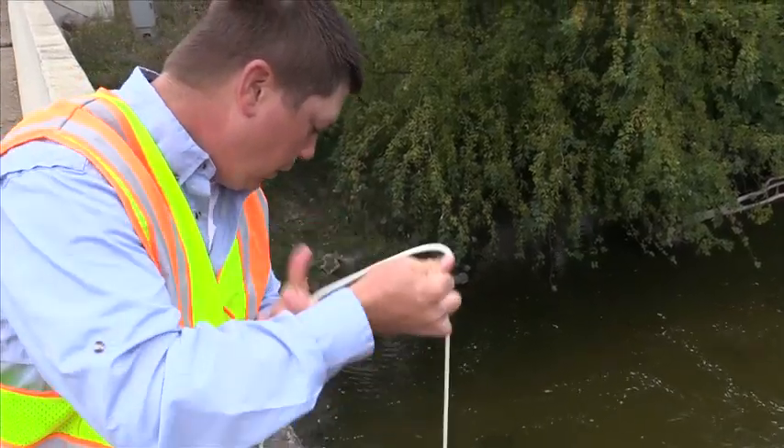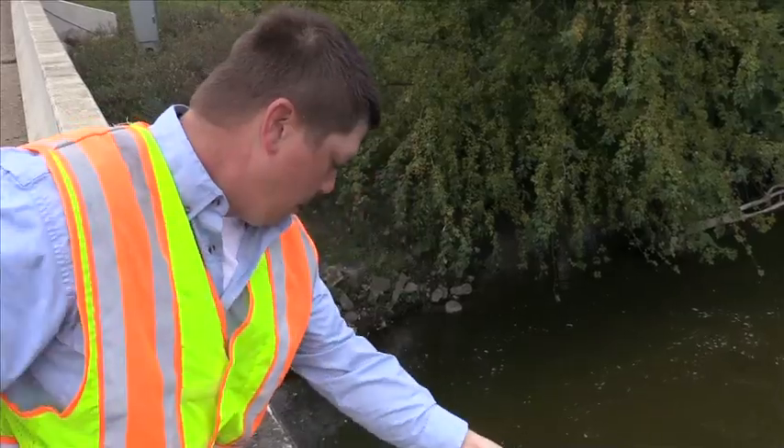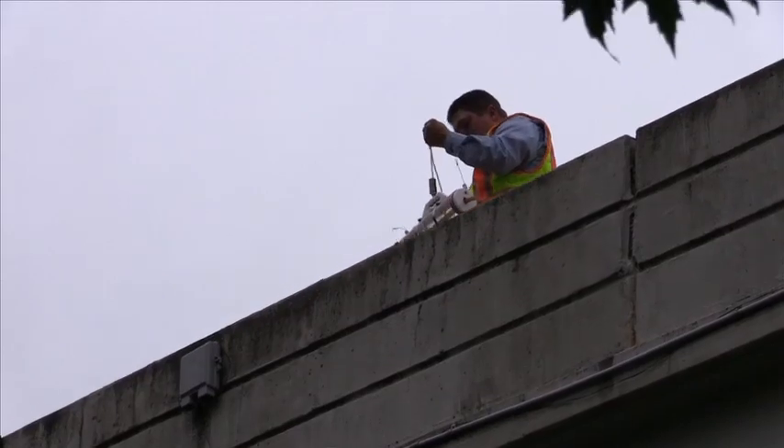Mike Wallerach is a water monitoring specialist with the Minnesota Pollution Control Agency. He's on Hawk Creek near Granite Falls to show how to properly take a water sample using a Van Dorn sampler.